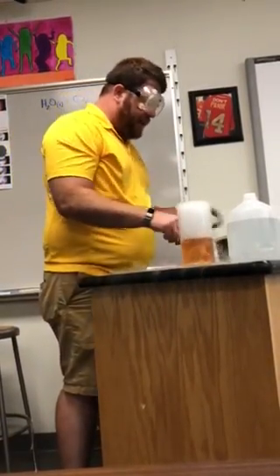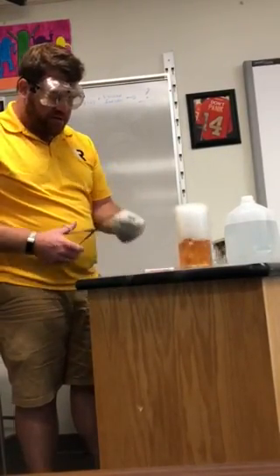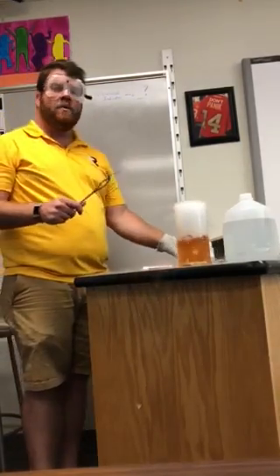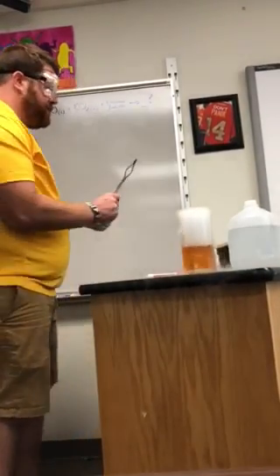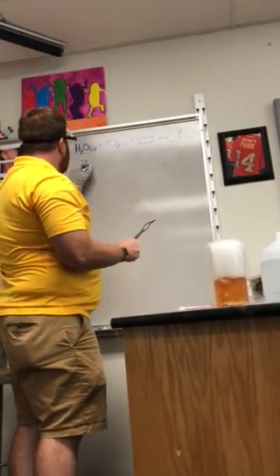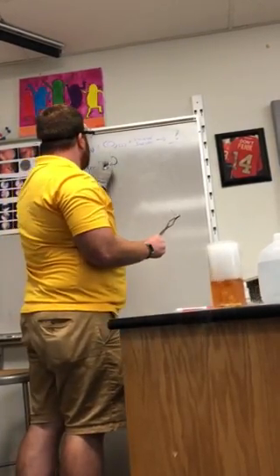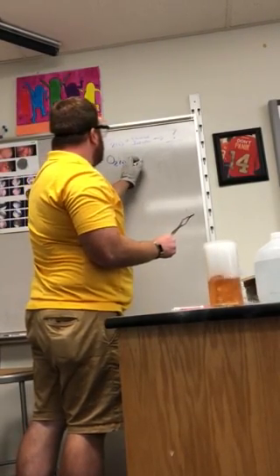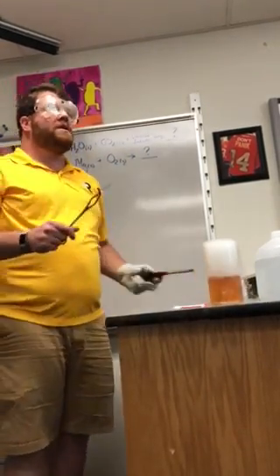Most metal can actually react with oxygen, and it will at some point, but this is just a great example of this. So I'm going to go ahead and hold on to this with a tong, and I'm going to tell you this right now, be advised, that when magnesium reacts with oxygen, it sparks. We have Mg, and this is a solid, and when we react this with oxygen, O2, as a gas, we end up creating something new. I want you to tell me what it is that you create.